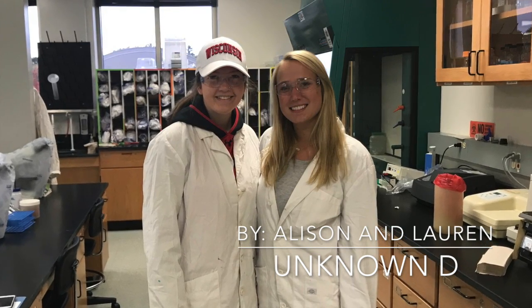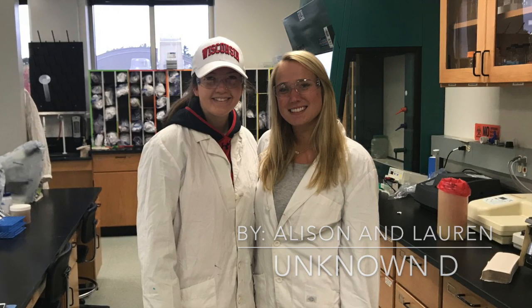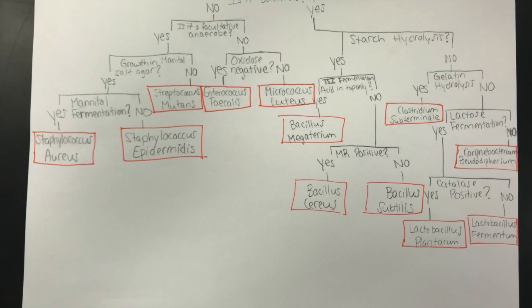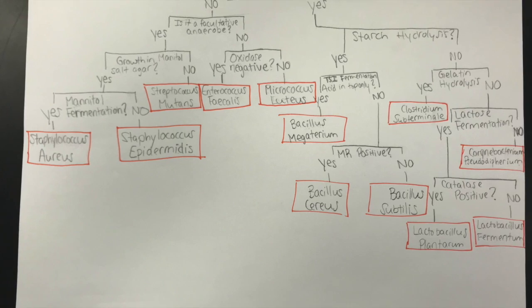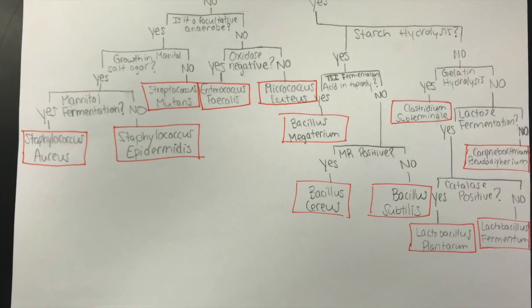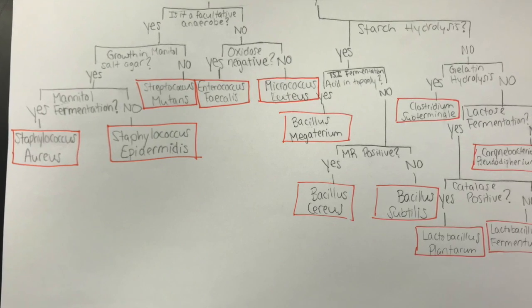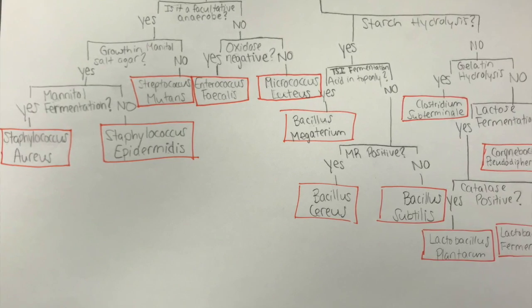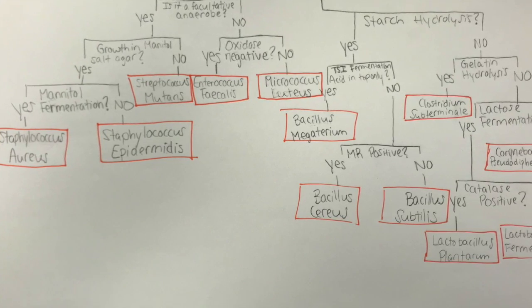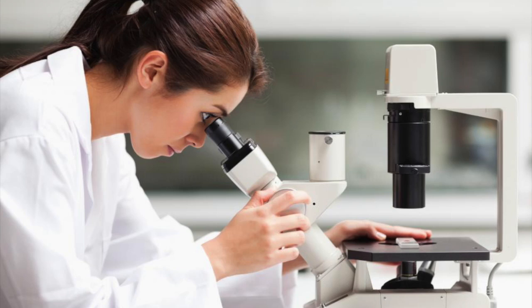We started off with the most basic classification tests, which were gram staining and morphology of our unknown. From there, we used our dichotomous key to determine which test would help us figure out what our unknown bacteria is. Using this method, we ended up performing the following metabolic tests: phenol red, TSI agar, catalase, oxidase, SIM, urease, and gelatin hydrolysis. Then, following all the metabolic tests, we performed different microbial growth tests to categorize the growth features of our unknown. All of the tests we performed, we followed standard procedure so that we wouldn't contaminate our tests and get false results.